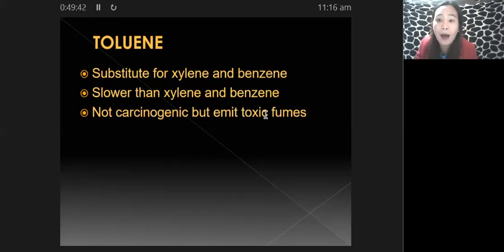So that means you have to be very careful when it comes to the storage of your toluene. Because if your toluene acidifies, you can no longer use it for the clearing process. So you have to store it properly, otherwise it will acidify, particularly in partially filled vessels. Say for example, the capacity of your storage container is 1 liter, and today you use 500 ml of toluene.